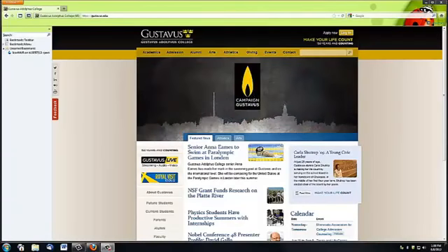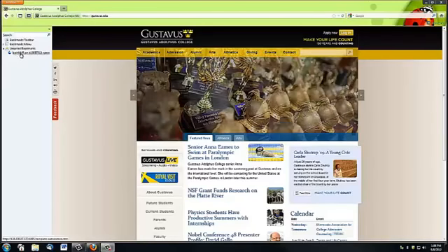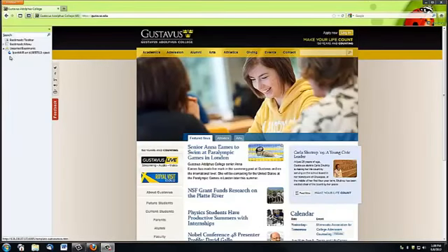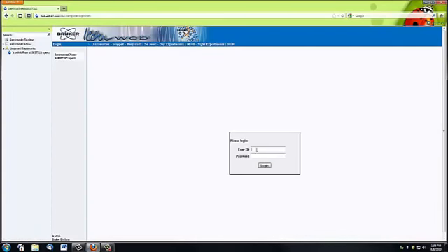This video will demonstrate how to queue an experiment using ICON NMR. To access the web interface of ICON NMR, you'll need to visit the website that's been provided by your instructor. We recommend that you bookmark this website because you'll be using it a lot.